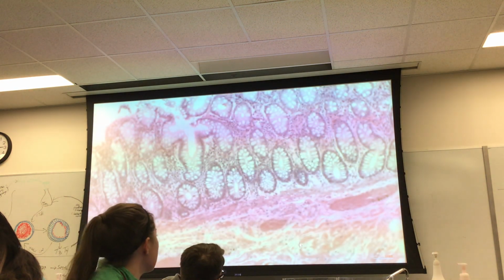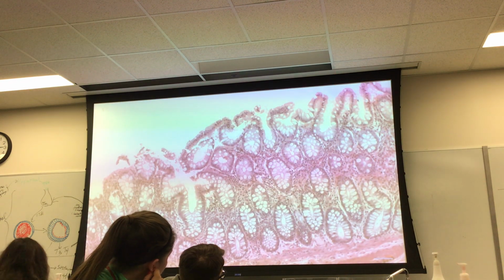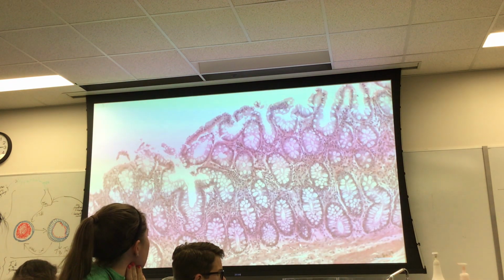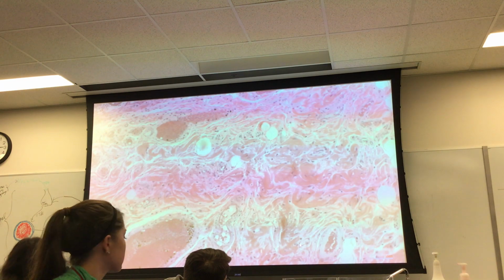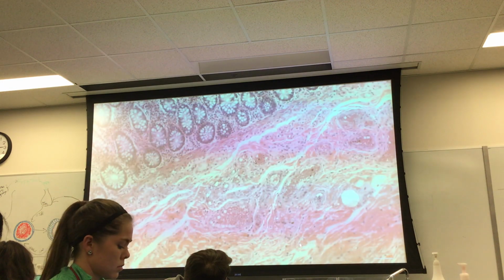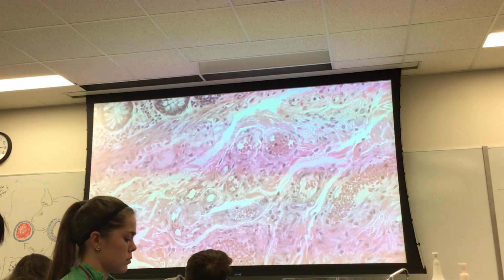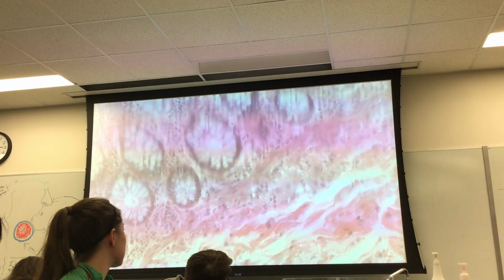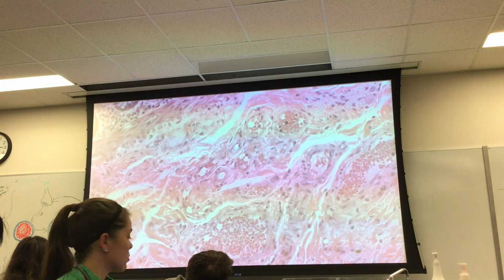Okay, so this is one of these where you kind of have to know something about organs just to understand the names. And so I had used this illustration just because this was obviously an epithelium, a mucosa, and this connective tissue down here, which is going to be dense irregular connective tissue, is loaded with nervous structures. Now, oftentimes when you look at a connective tissue, you may see nerves and so forth, but what you're not going to see is neurons. And so what makes this special is that you're actually looking at neurons. So let me find an example for you.